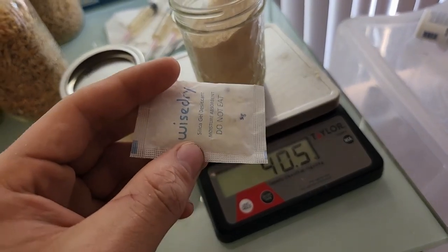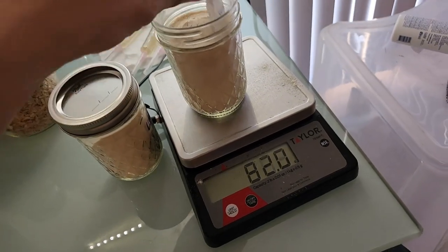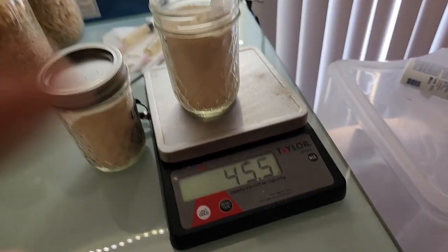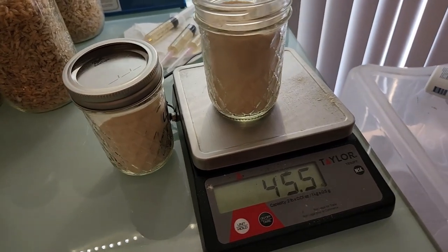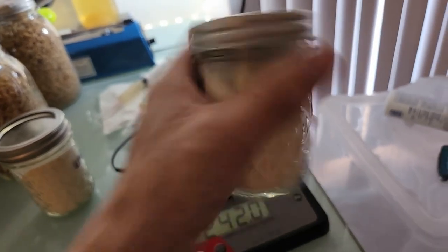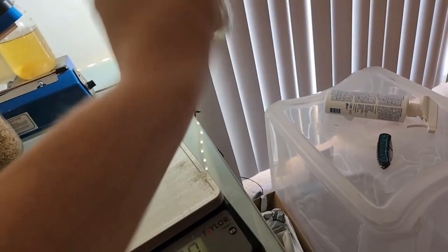I like to add a silica packet just to keep things dry in there. And that's it, you've mixed up your recipe. I'll show you how to cook it. But first you want to make sure it's very thoroughly mixed.